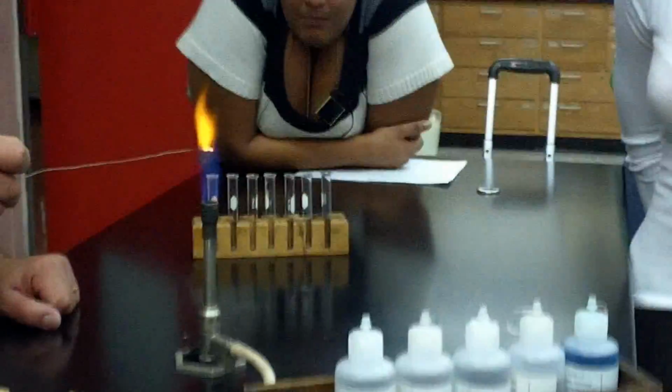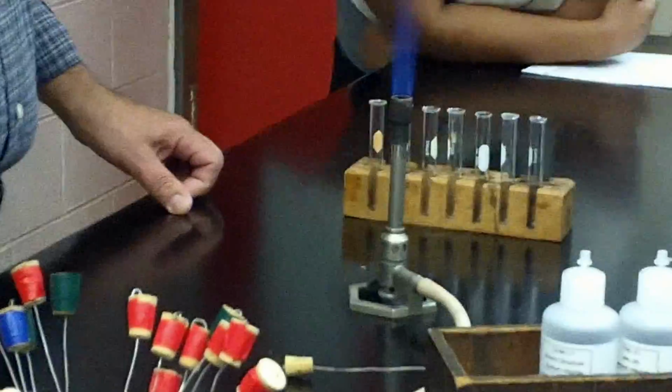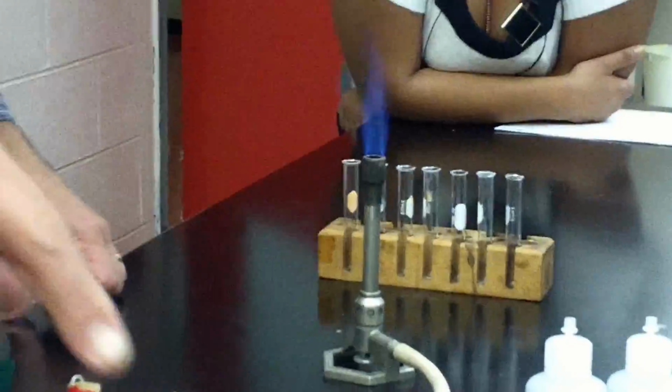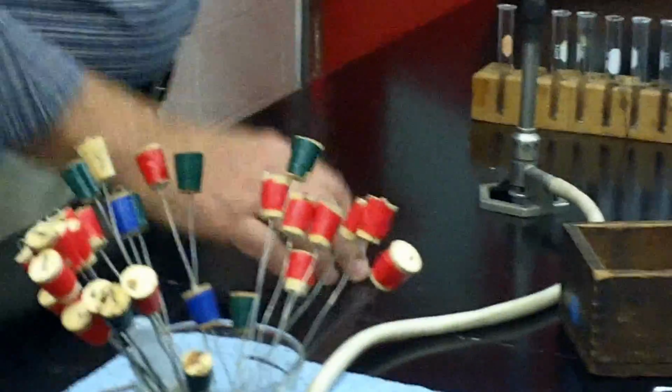Orange. Yellow orange or orange, something like that, okay? Now, the purpose of this experiment is to give you an understanding of what produces color. Why are these red and why are those green? Why is this blue, etc.